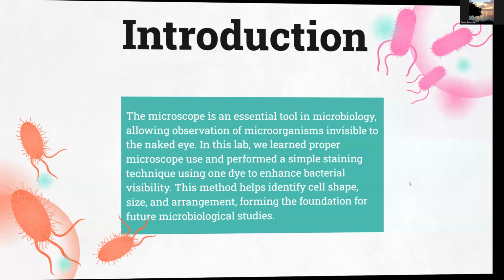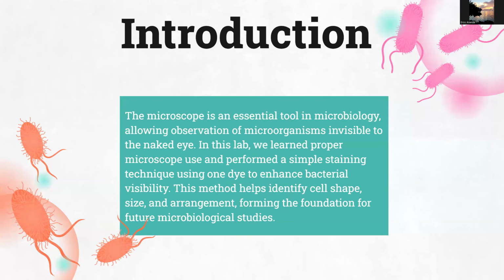So, introduction. The microscope, obviously, is very important. We use it all the time. Microbiology, it's in the name. We can't see these super small microscopic organisms with our eye, so we have to learn to use microscopes to see them. Thing is, a lot of the time we can't see these bacteria without staining techniques. So here we can do simple staining and other methods of staining that will help.